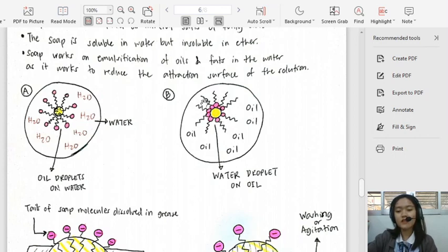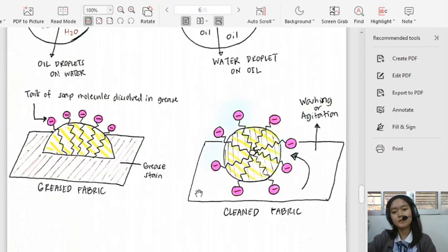Kaya, nagkakaroon or your water when dropped to oil will form globules din, bilog din, kasi kita nyo, the oil forms a barrier or a circle barrier doon sa water. Kaya nagkakaroon ng droplets of water. And nandito, droplets of oil din when in water solution.